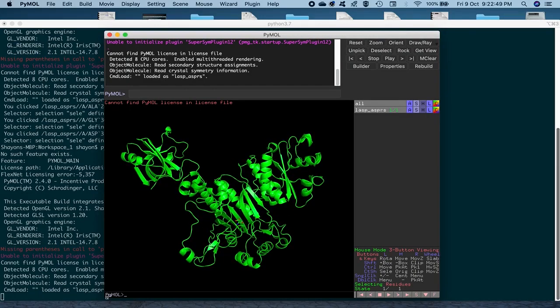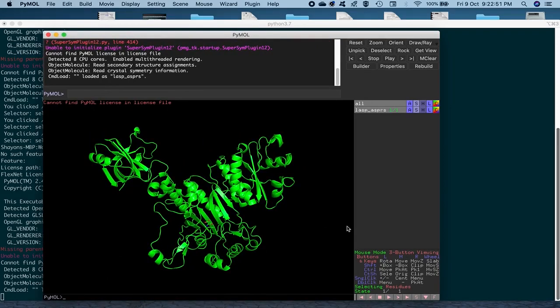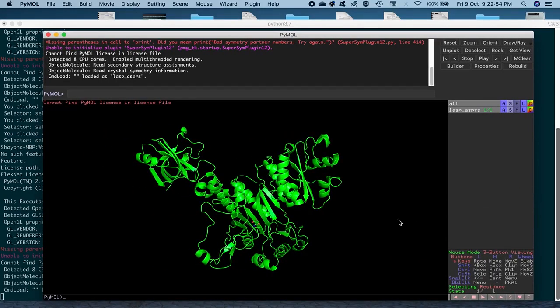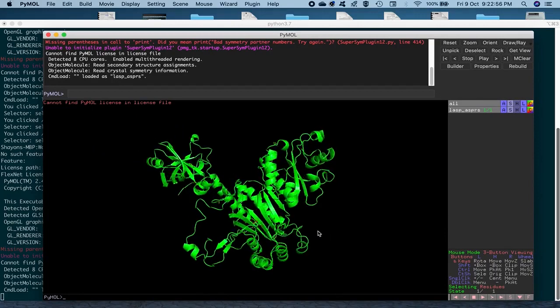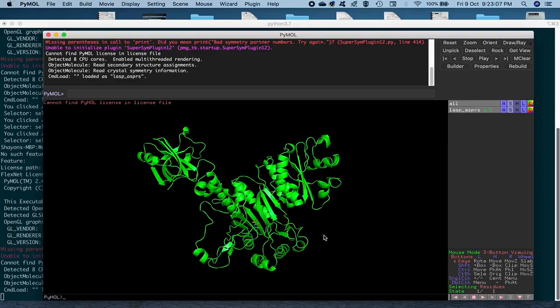So we don't need to do any kind of change in the representation. So I could show you more about the features of the representation in PyMOL as well, like Chimera and VMD can create beautiful pictures. But then again, the focus of this tutorial is not the representation, we'll deal with it in some other tutorial.